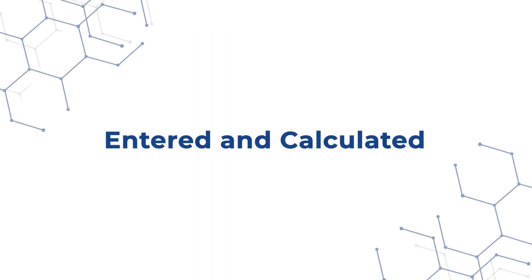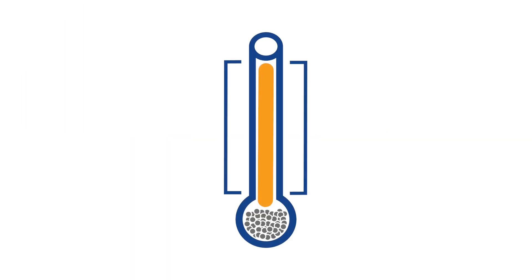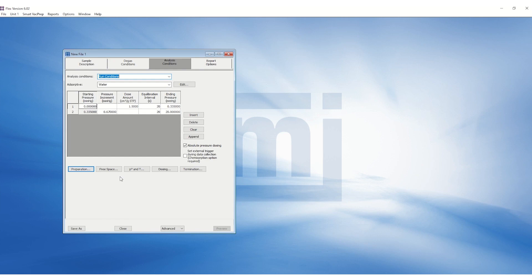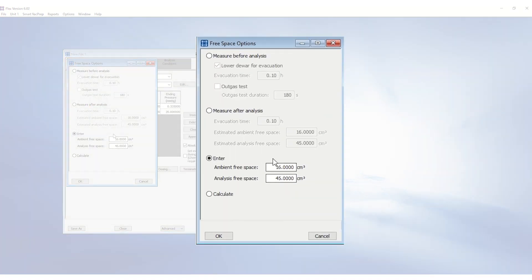Entering and calculating free space can help the helium entrapment issue. Entering the free space skips the free space measurement so the sample is exposed to the adsorptive gas before being exposed to helium. The enter free space values should be close to the measure values since this information is used for determining the dose amount.